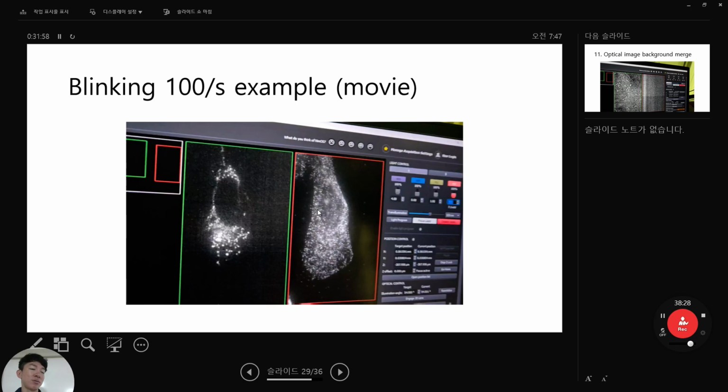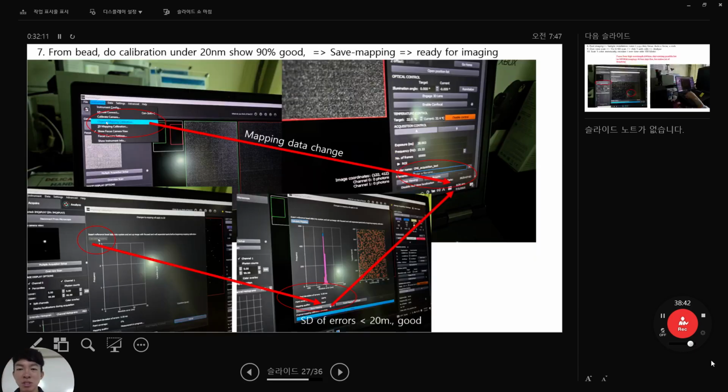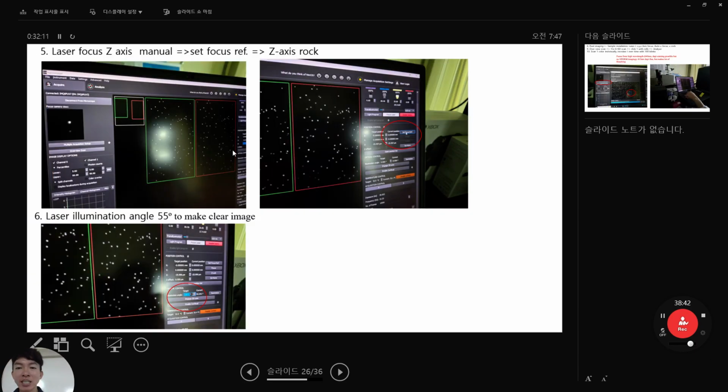Yeah. Sometimes after staining two types, maybe 580 something, 620, as I told you, these overlap each other. If you excite this 647, this 587 dye is also excited.